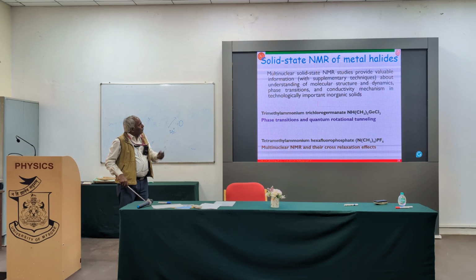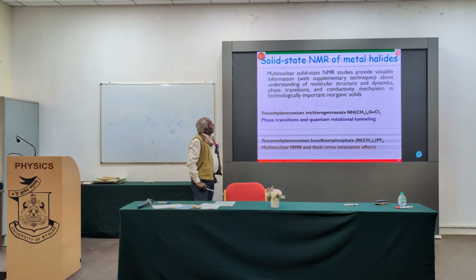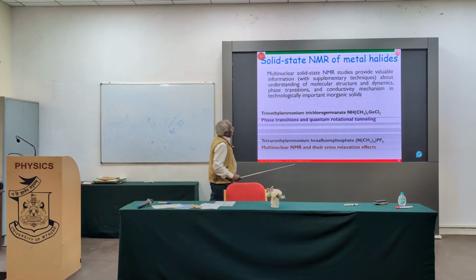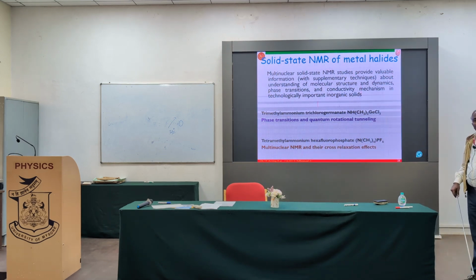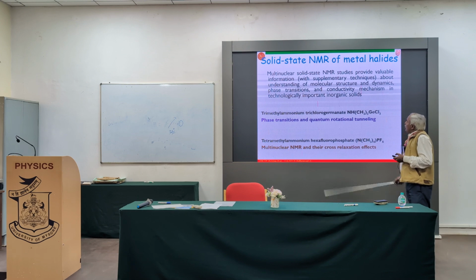Now, what we did here, we did multi-nuclear solid state NMR studies. They provide information about molecular structure as well as dynamics. As I told you in the morning, dynamics means all the motions which are happening, on my face and hands and other things; all of them can be captured in one go.